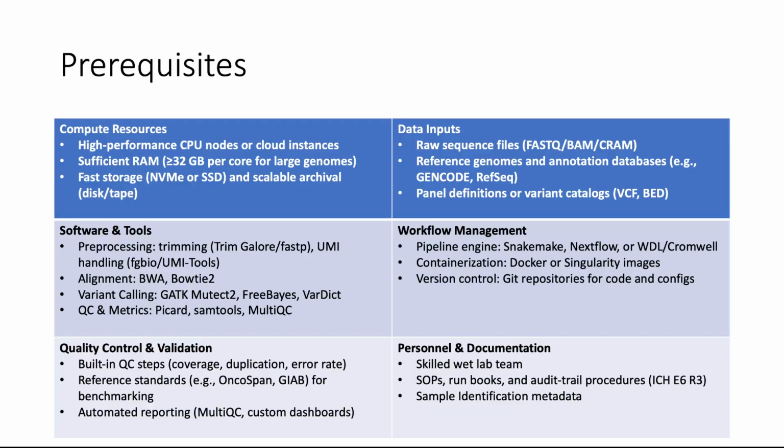For quality control, we'll use data provided in our run as metadata. Also, we can use a reference standard, which could be added to our samples, so we can make this validation. And of course, we'll need this process to be tailored and documented, and we need our samples to be easily identified in future in this process.